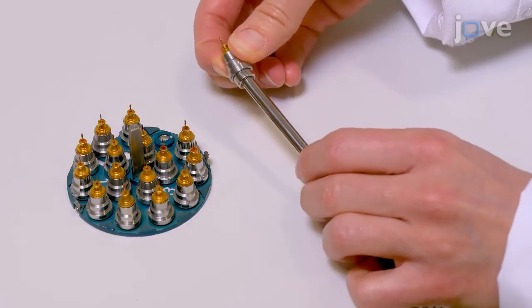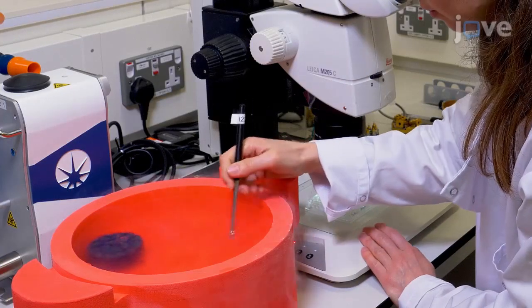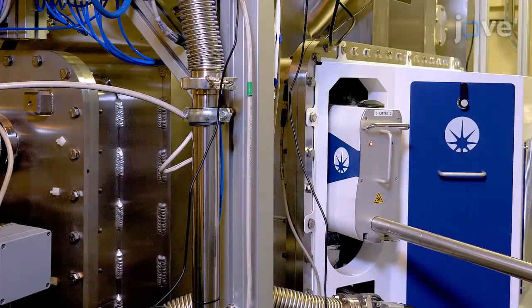Due to the significant absorption of x-rays by air in the long wavelength regime, these experiments are performed in a vacuum environment. To keep samples at cryogenic temperatures inside the vacuum environment, the crystals are mounted on dedicated thermally conductive sample holders. The cryogenic sample transfer from liquid nitrogen to the vacuum end station is very similar to the techniques used in cryo-electron microscopy.